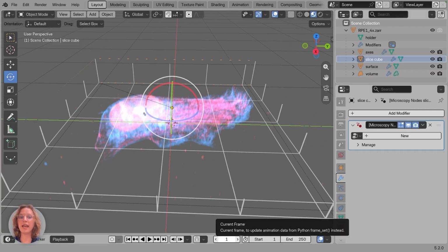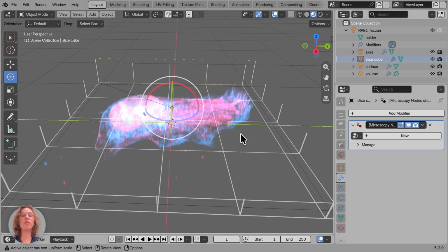We've selected a dataset, we've chosen a scale, we've configured the channels, we've loaded them, and adjusted how they are visualized. So this is the basics of Microscopy Nodes, and anything else will just depend on your data and the exact things of your visualization, and is essentially more advanced. So I want to quickly show two other types of data to see how we handle them.